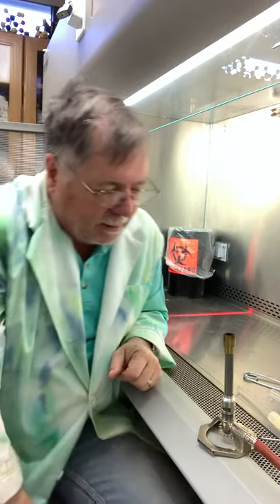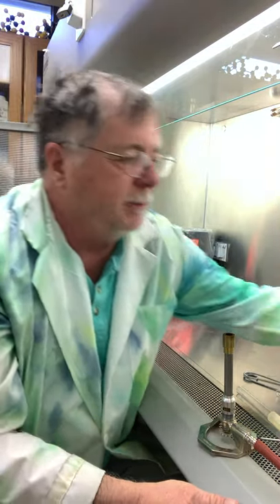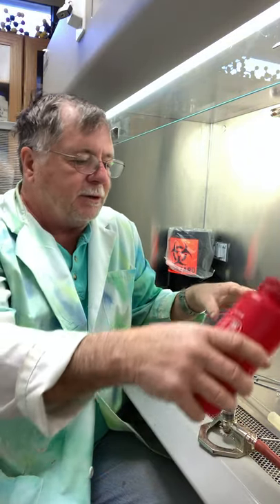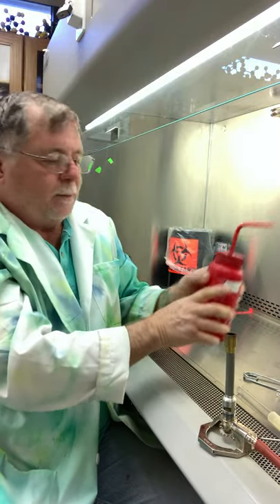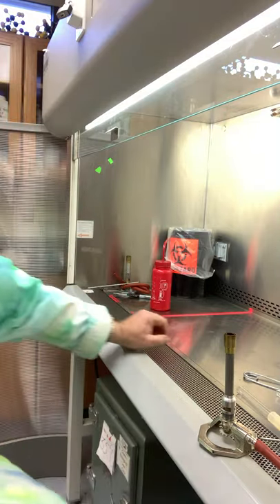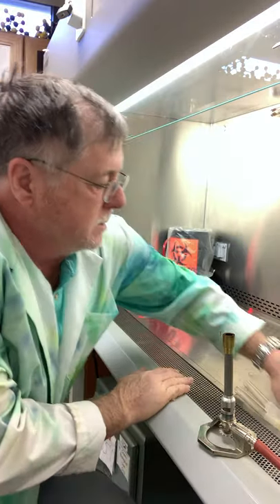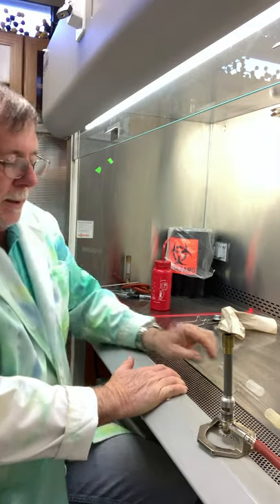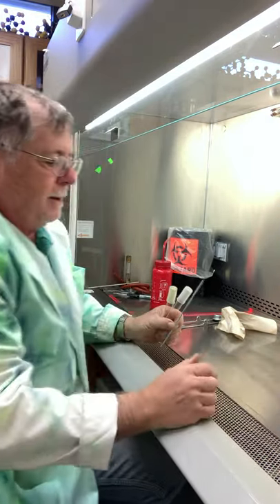All right, so now I'm going to walk you through the whole thing from start to finish. So the first thing you want to do is Virex your surface area. We have a little squirt bottle of Virex. We have to Virex it, and then we'll wipe it down with a paper towel. Okay, and then we can get our bacteria and equipment gathered, and then we're going to set this up.